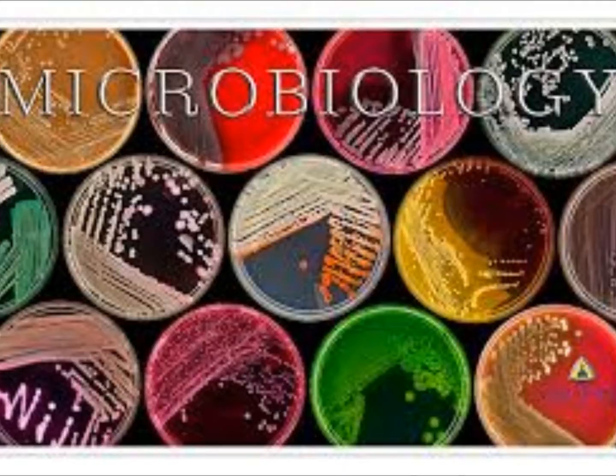I left the hemolysis plates back here, I left the size plates, and I left the color plates. So at minimum on the blood plate, at least record color and size. And look at it from the side, that's another easy one. Is it mounded or raised, or completely flat on the plate? There are magnifiers in each drawer. The black magnifier is for your help too.